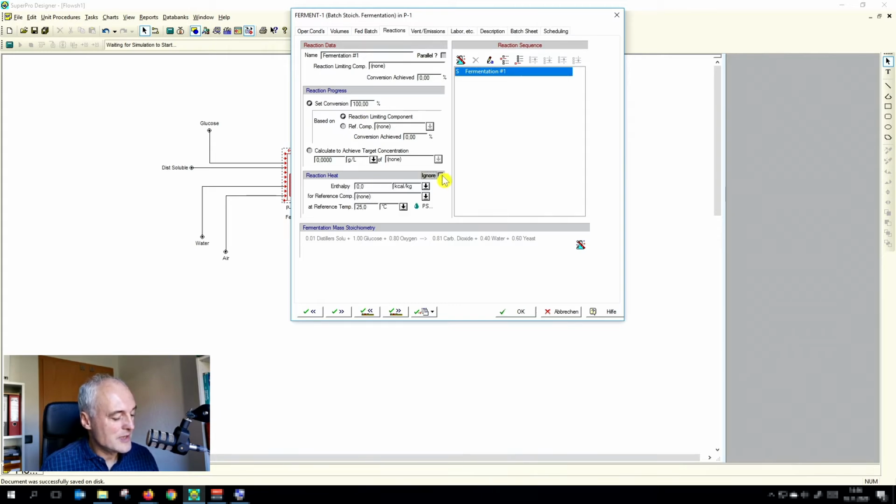And we want here to take care about the reaction heat. What we have calculated is based on our oxygen consumption. You can directly calculate the heat of reaction. You have the oxygen, you just need to convert the masses of oxygen into moles and then multiply it with minus 460 kilojoule per mole, and that's it. And this you put then inside here to the reaction heat.